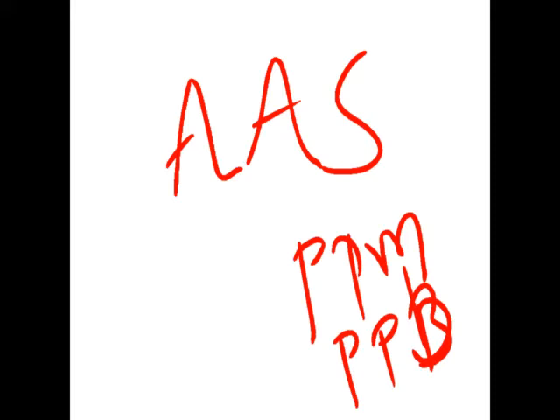Second thing, if you remember flame photometry, we can find out some of the earth metals present in the given sample. But if a given sample consists of only one element, we can utilize flame photometry. If the sample has more than one or two elements, it is difficult to use flame photometry, because the reading of one metal element will interfere with the reading of others.